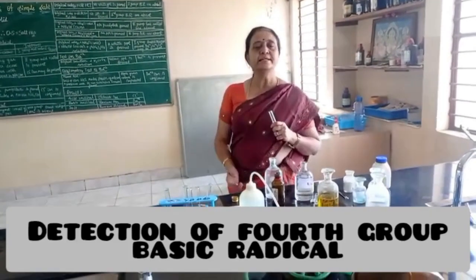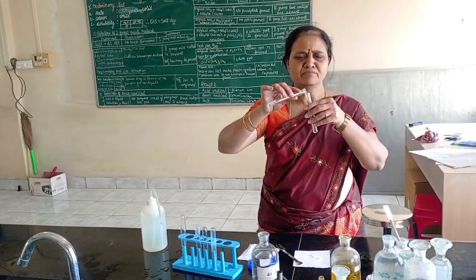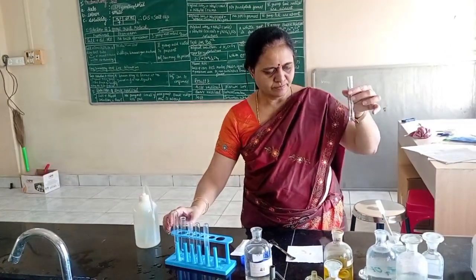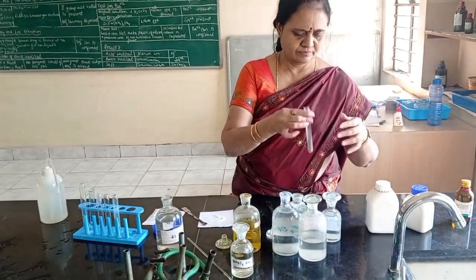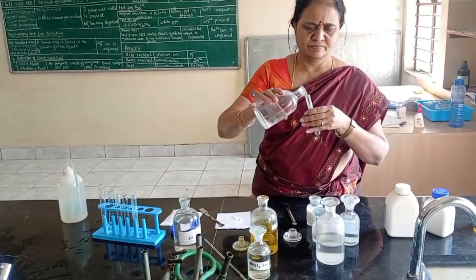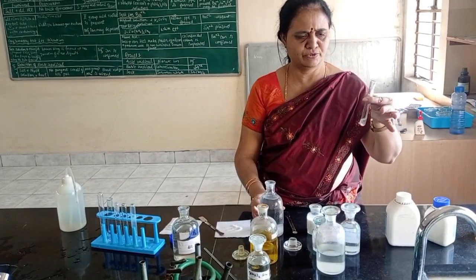Then I move to detection of fourth group basic radical. I am taking original solution, adding solid NH4Cl, then adding NH4OH excess.